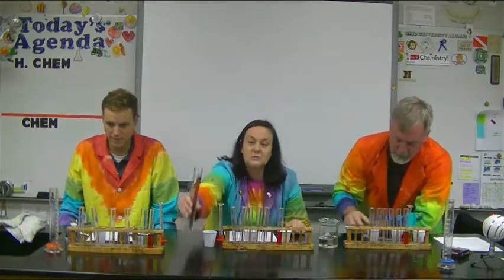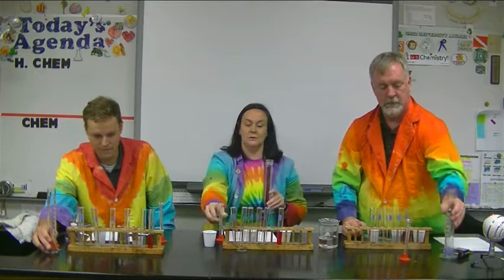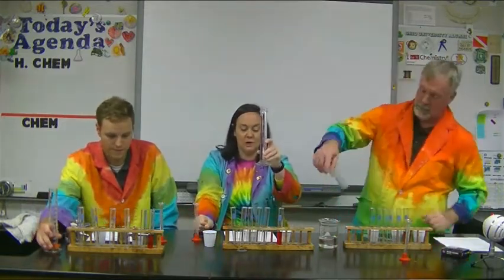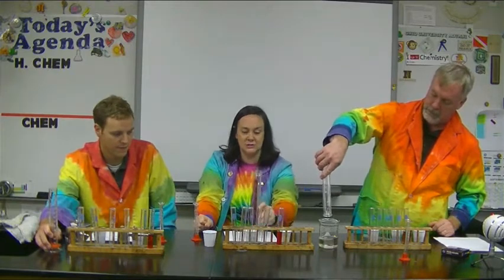All right. So step number 5, we're going to put 25 milliliters of yellow solution into test tube C. I'm probably going to use my 100 ml here because we don't want to fill this up 2.5 times. So 100 ml, we need 25 milliliters of the yellow solution into test tube C.